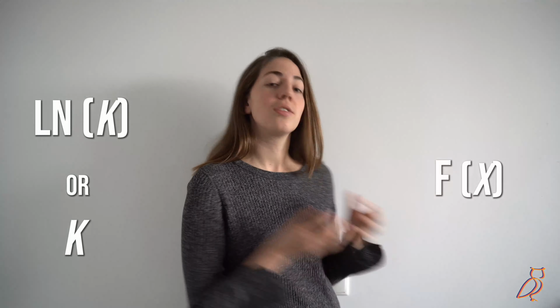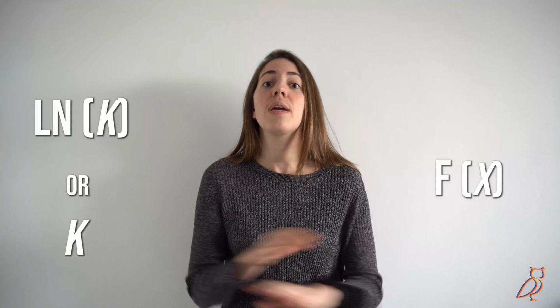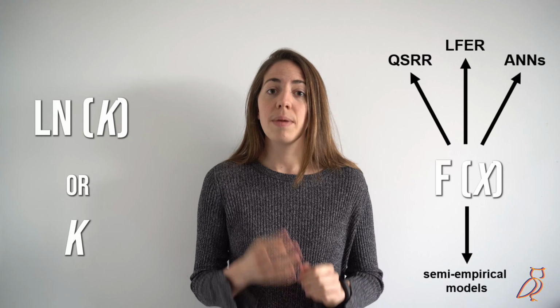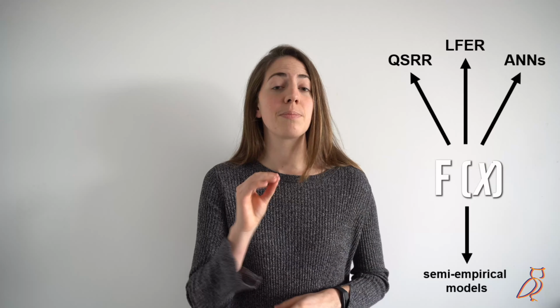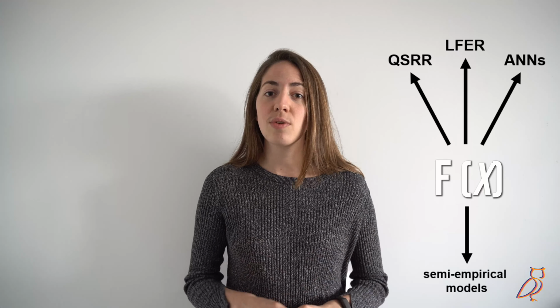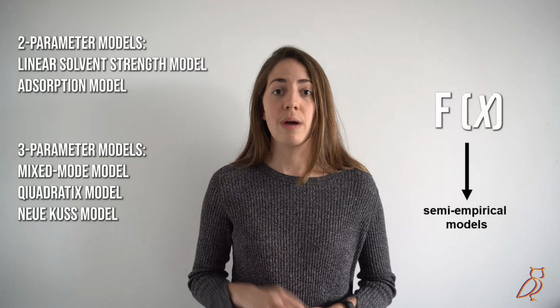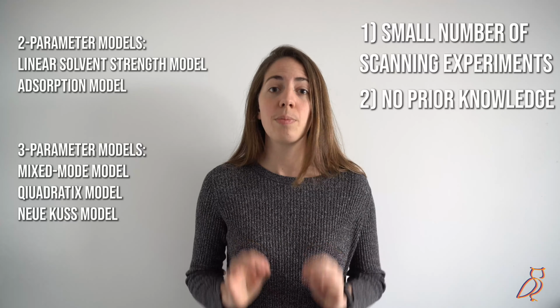The basis of a retention model is a retention parameter describing retention and a function describing system and analyte parameters. The complexity of this function can vary enormously, leading to a different number of input data needed. Because we want to make retention modeling as applicable to you, our day-to-day user, that probably has many other things on his or her mind, we decided to focus this review only on semi-empirical models, because these only have 2 or 3 parameters and thus only need a small number of input experiments and no prior knowledge.